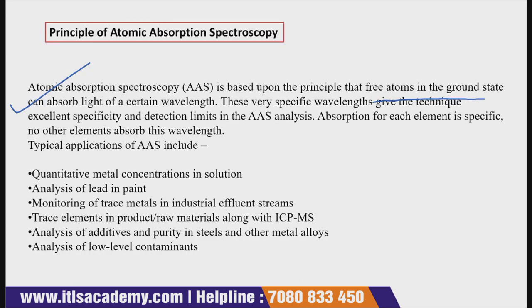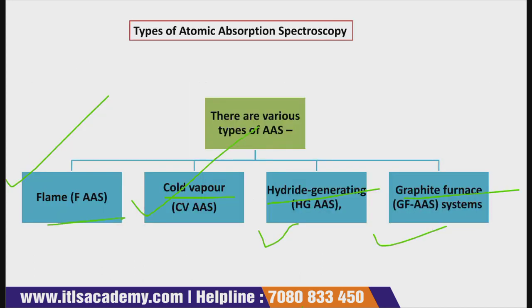They can ask you about the principle, because every spectroscopy, whether it's X-ray fluorescence spectroscopy, atomic absorption or atomic emission spectroscopy, whichever spectroscopy or chromatography technique, every analytical technique has a specific principle, and the principle part is very important. So you must know the principle behind each spectroscopy.